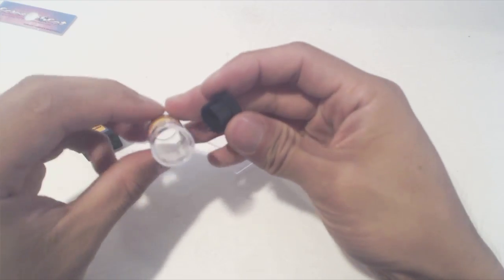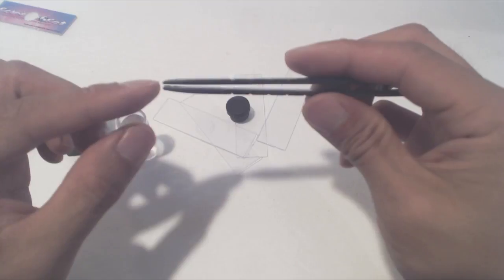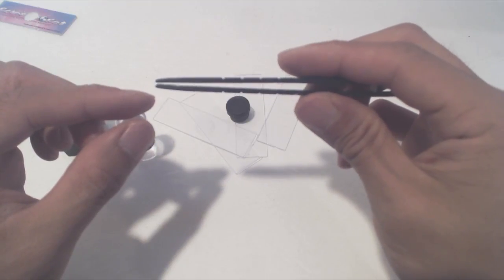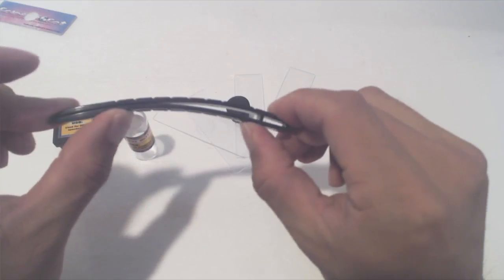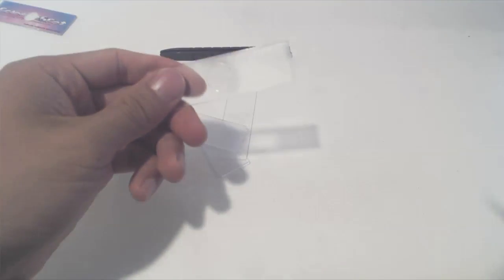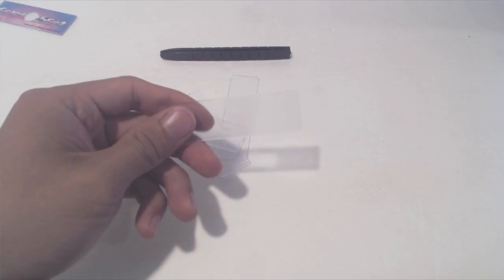The vials are plastic and can hold a small amount of liquid and small specimens. The tweezers are quite narrow and have an opening of about a sixteenth of an inch. It takes very little pressure to operate it, though it's a bit flimsy. The slides are made of plastic and not glass so they won't break or shatter easily.